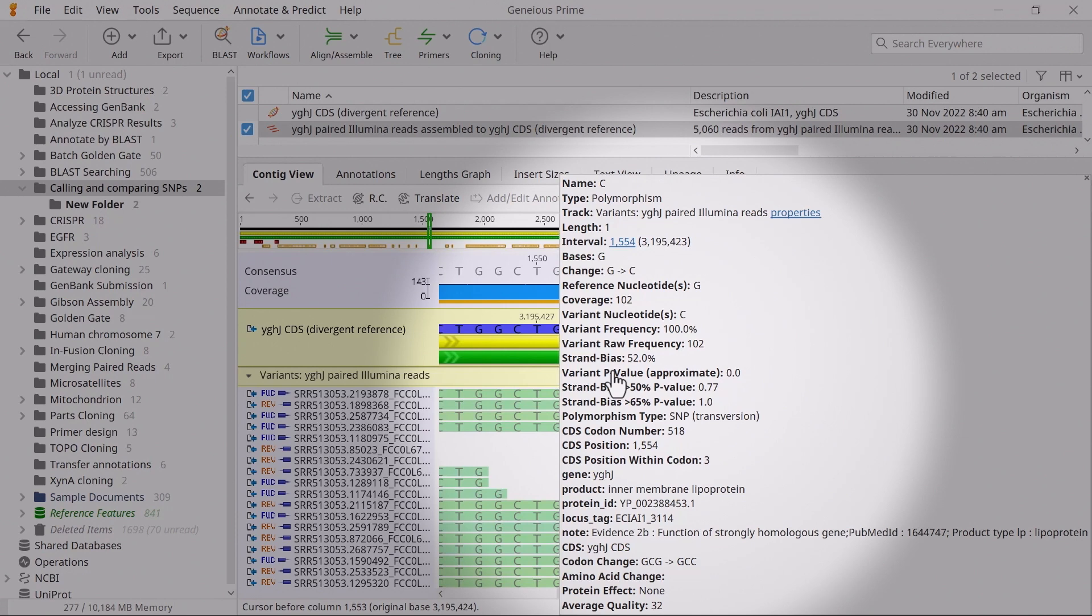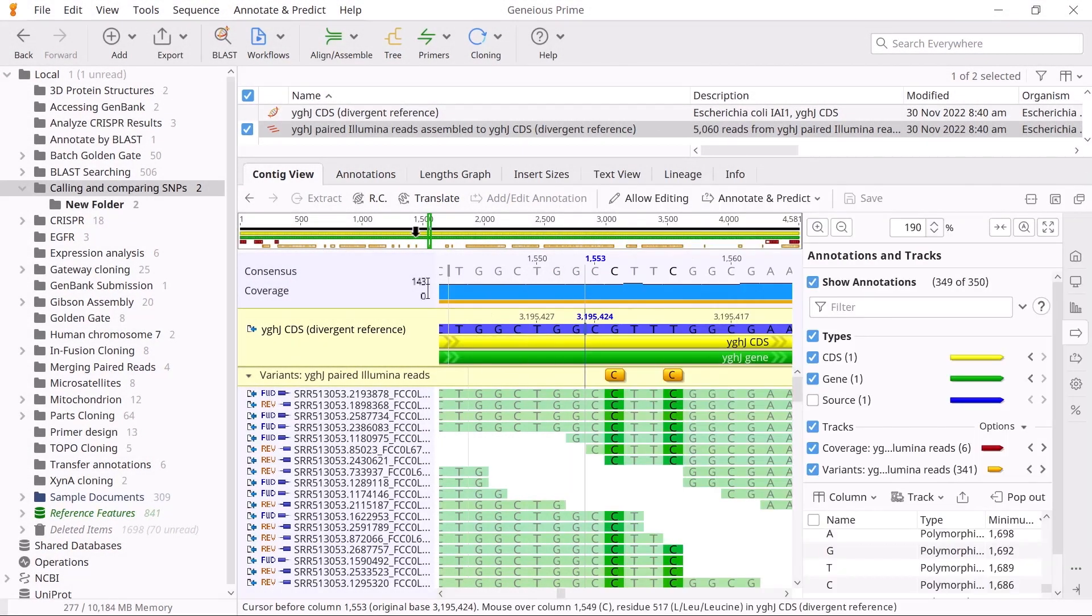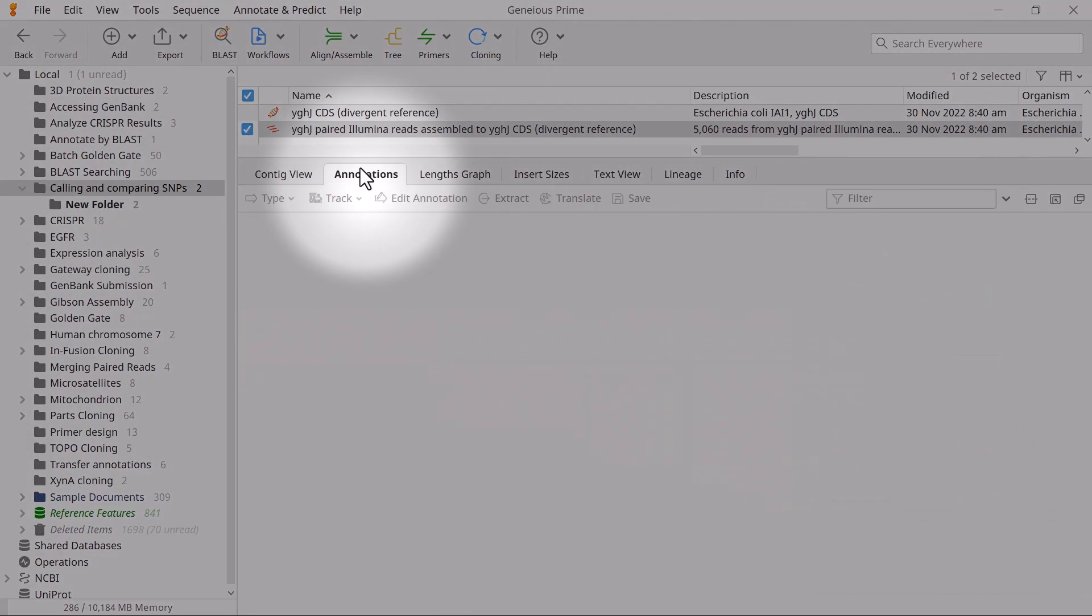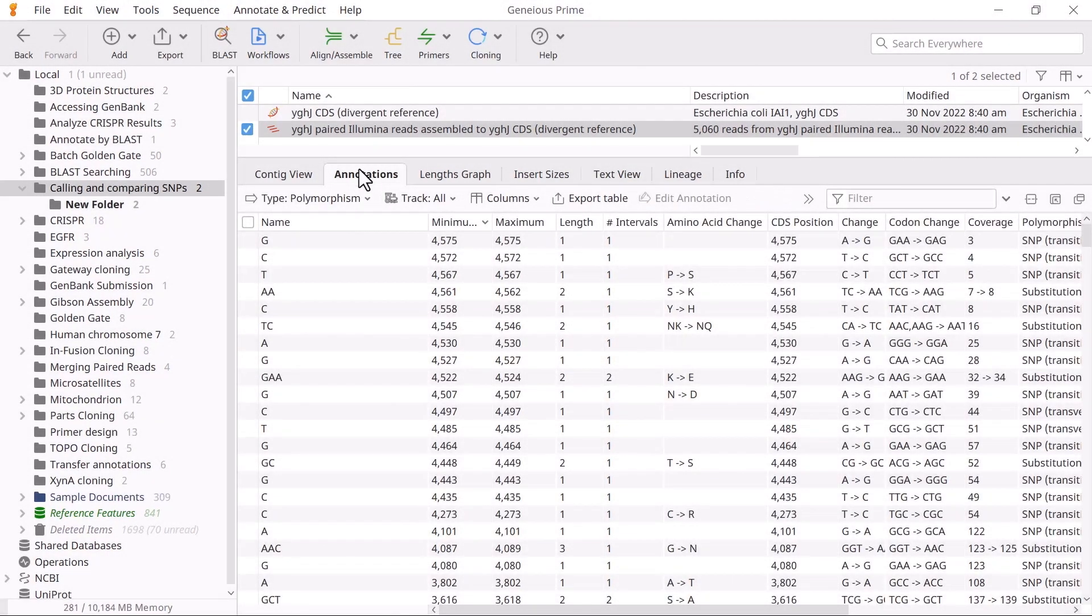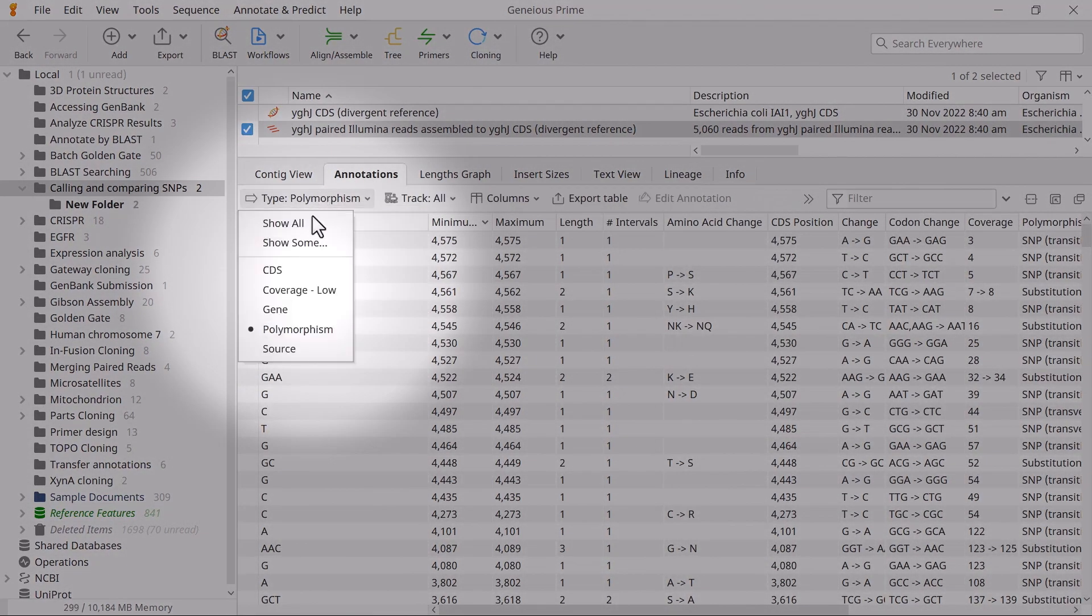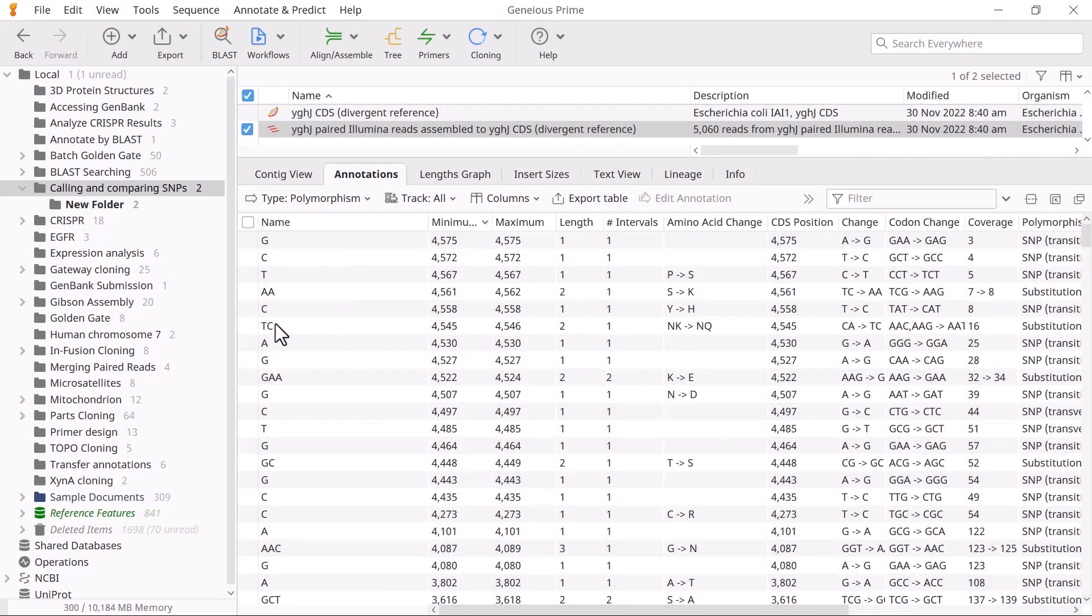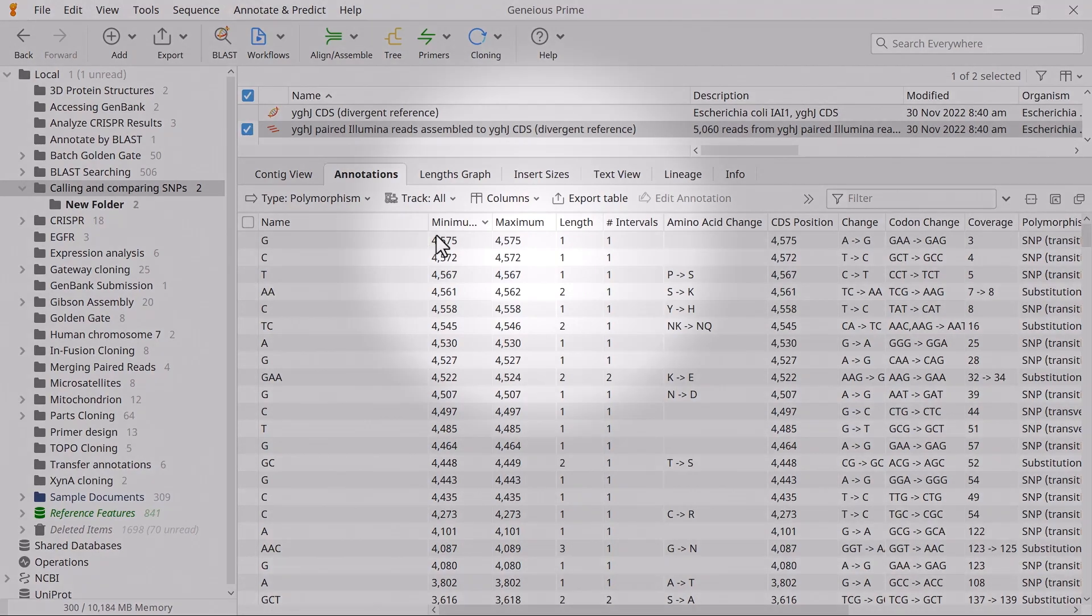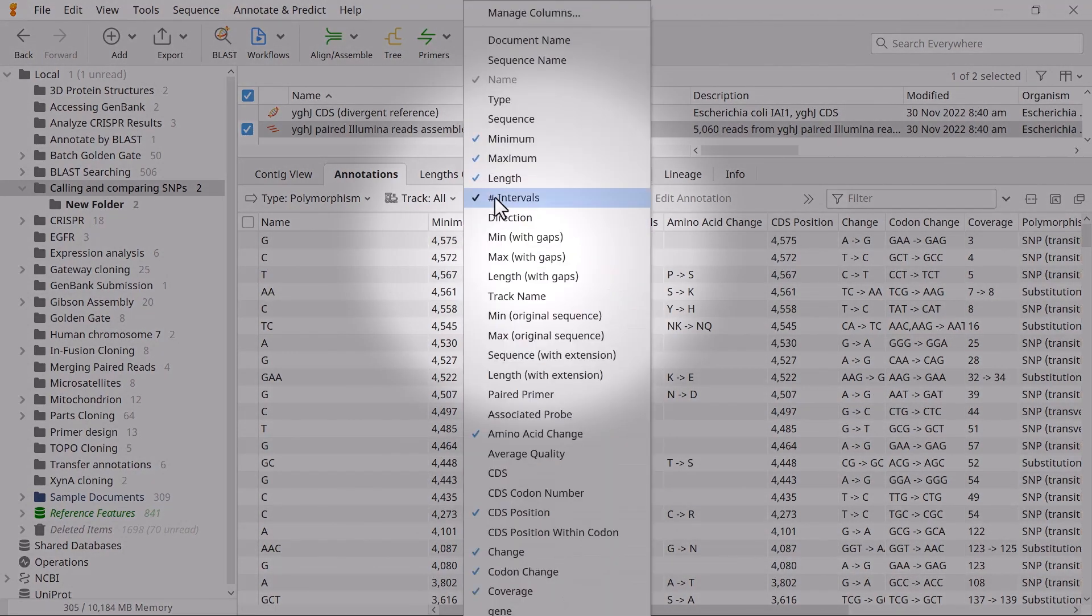To view this information in tabular format, switch to the Annotations tab, then change the type to Polymorphism to only view the SNP annotations. You can also adjust the data shown in the table by selecting columns and adding or removing the columns you want.